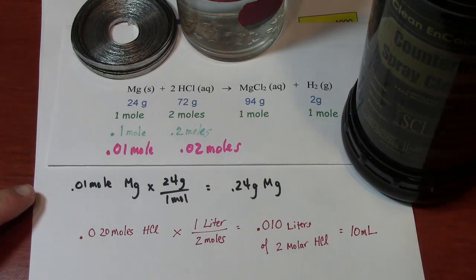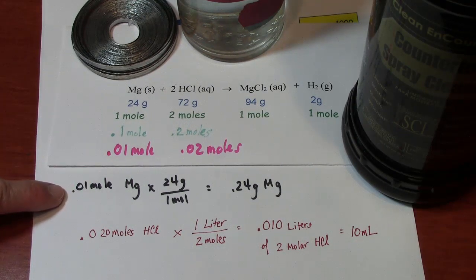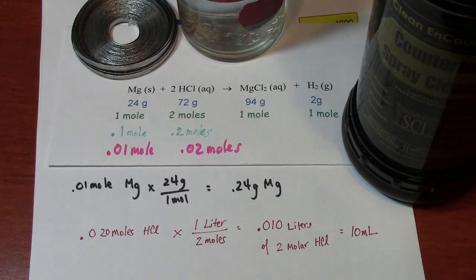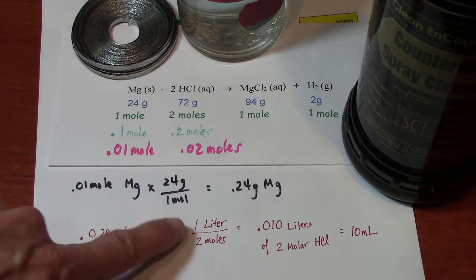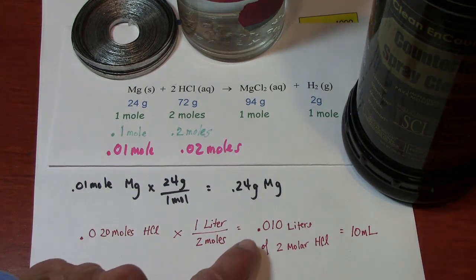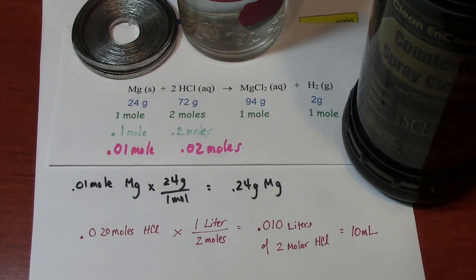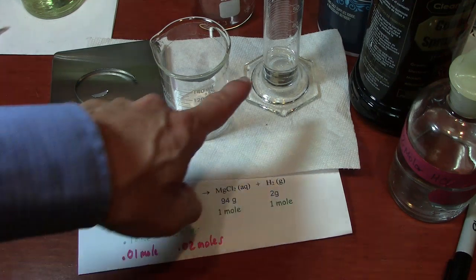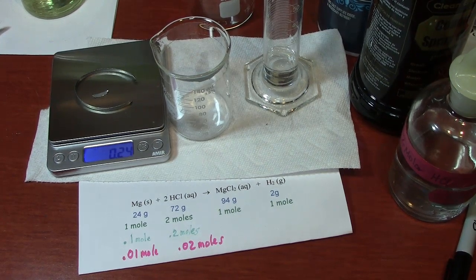Here I've done some dimensional analysis to calculate, if I did this pink scale reaction, how much magnesium do I need? It's 24 grams for 1 mole. I only need 1/100th of a mole. It's 0.24 grams. For the HCl, I've calculated I need 0.02 moles. 1 liter has 2 moles, so that's 0.01 liters, which is 10 milliliters. That's what I'm going to do in a small beaker or test tube. So here I've got the 0.01 moles, 0.24 grams of magnesium. I put 10 milliliters of the HCl in my cylinder, ready to run the reaction with the proper ratios.